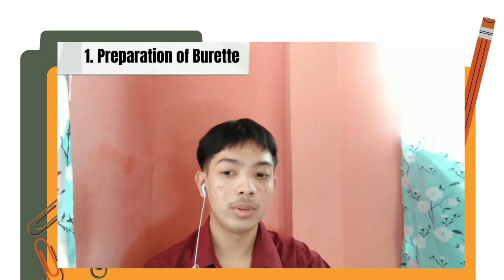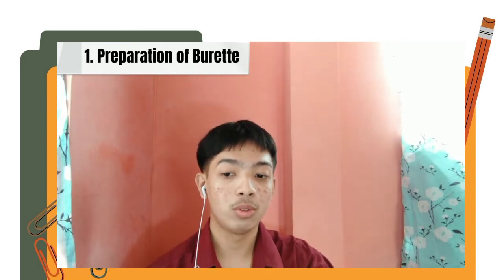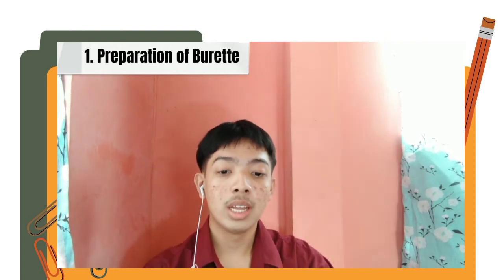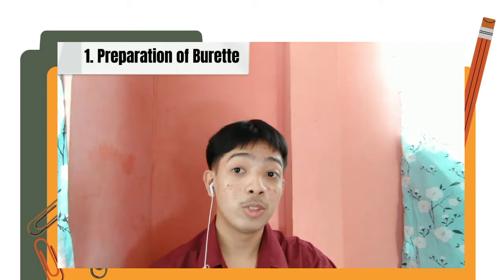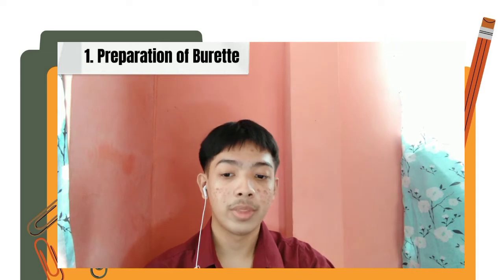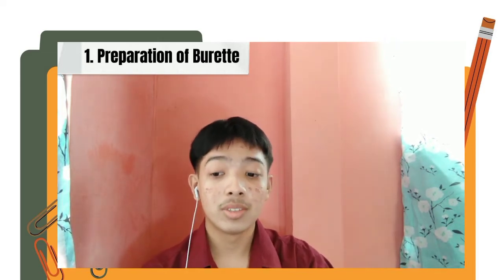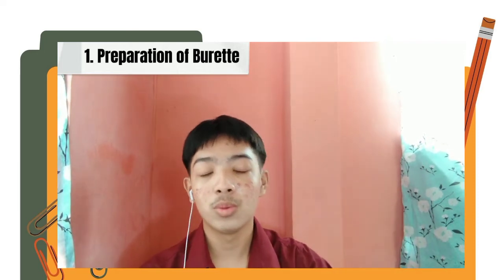So the first thing we need to do is to prepare our burette. Rinse a previously clean burette with approximately 4 ml of sodium hydroxide solution to allow some of the liquid to run through the tip of the burette, and then repeat the rinsing process 2 more times, discarding the sodium hydroxide used each time. Then fill the burette with 0.10 M sodium hydroxide, taking care that no air bubble is trapped in the space below the stopcock, and then clamp the burette onto an iron stand.